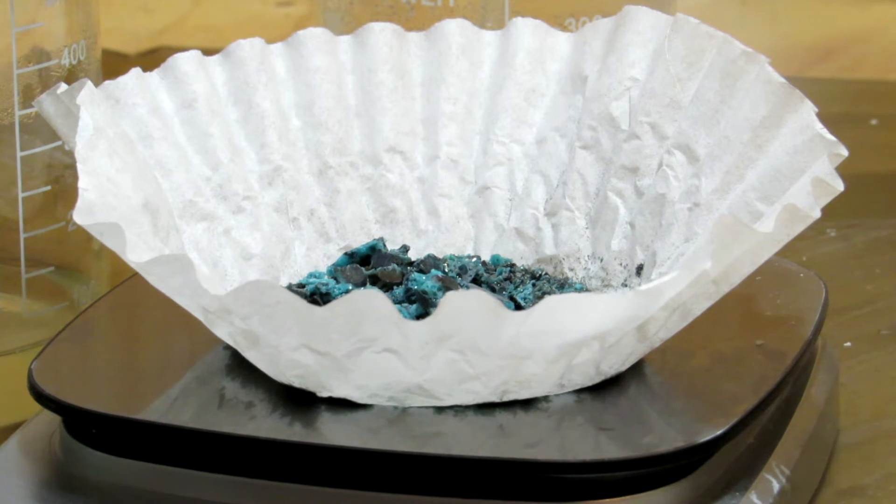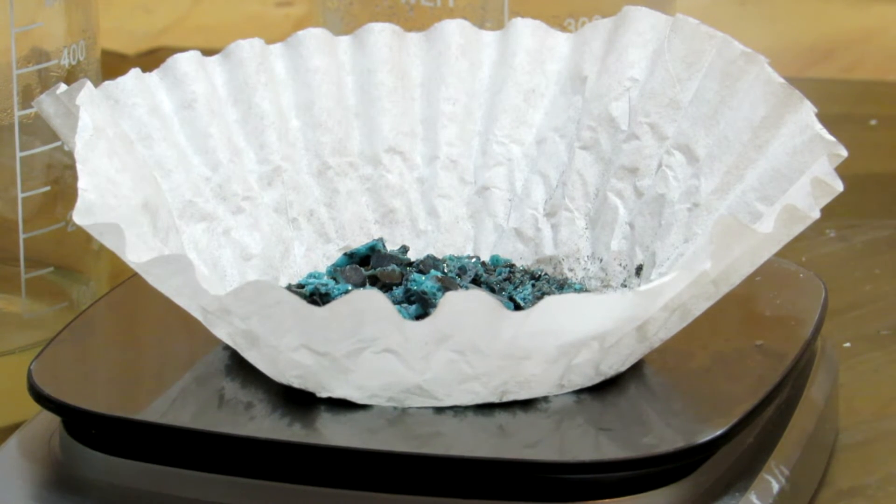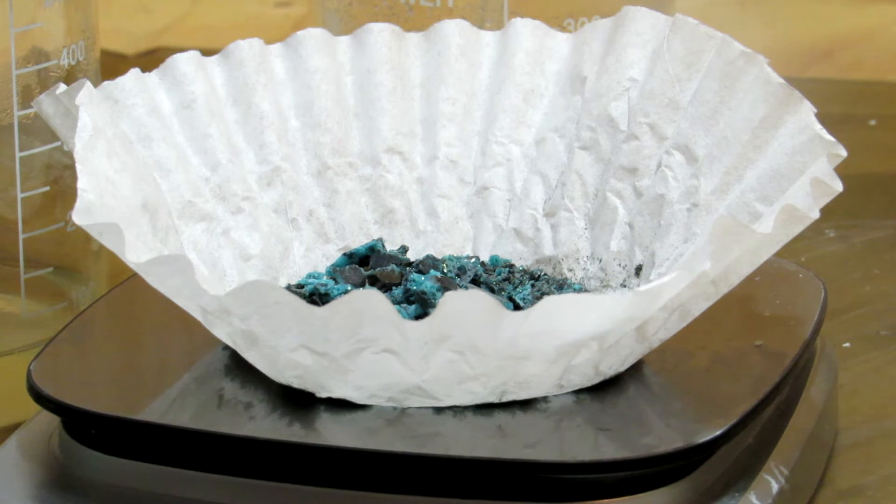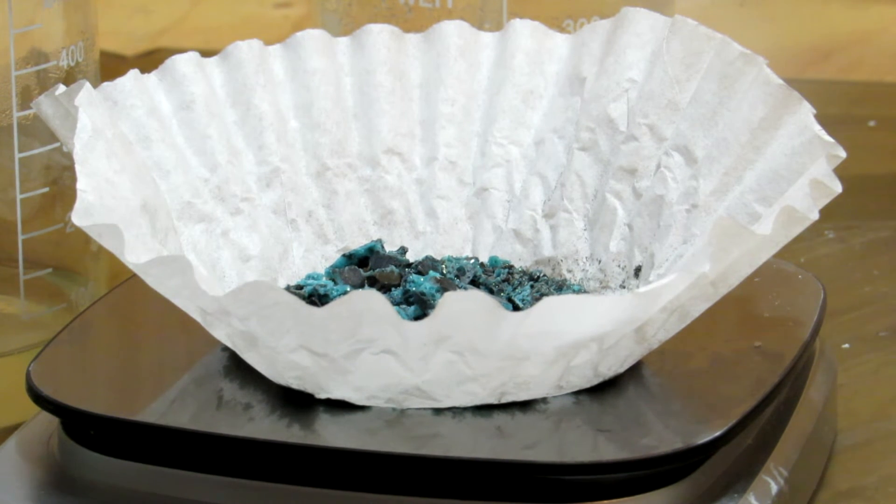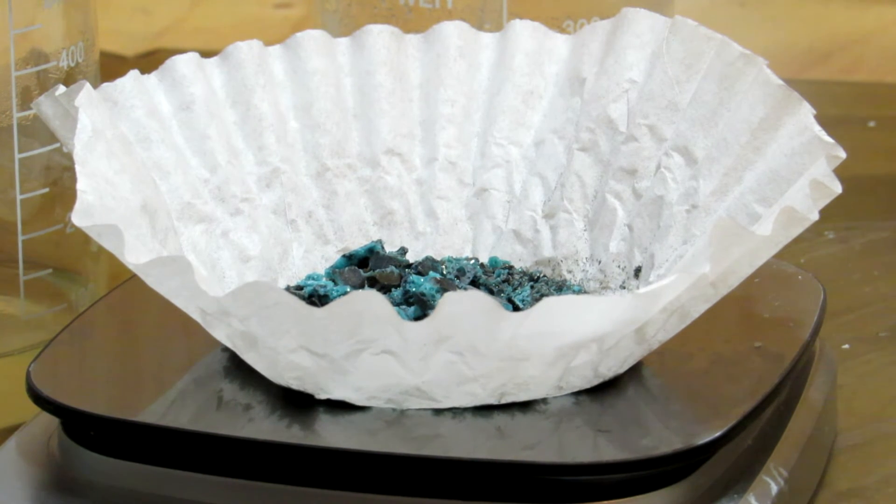So, I'll go ahead and repeat the previous steps to make some more sodium dihydrogen phosphate on my own time, and then make more sodium hexametaphosphate so that we can go ahead and finally make some white phosphorus. If you're wondering why I need white phosphorus, I need it to make some phosphorus pentoxide, which is a powerful dehydrating agent, so we'll be doing that in a future video.